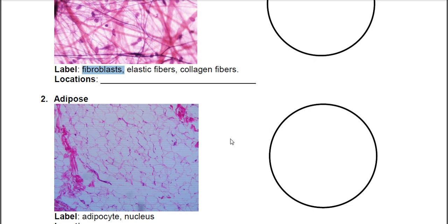So this is a microscope slide. It was sliced. When they sliced it, the fat came out. So on the slide, it is empty space. But in your body, it is filled with fat and lipids.